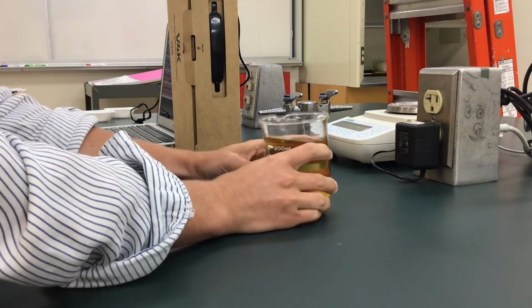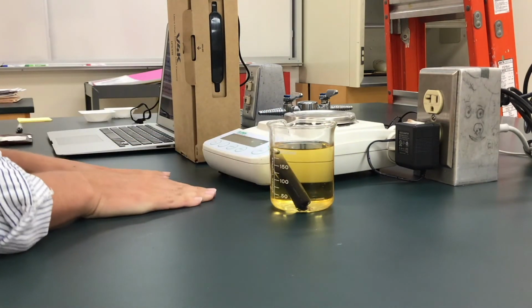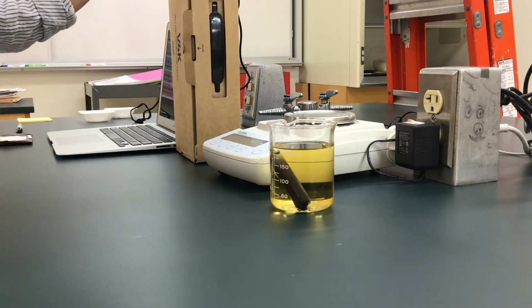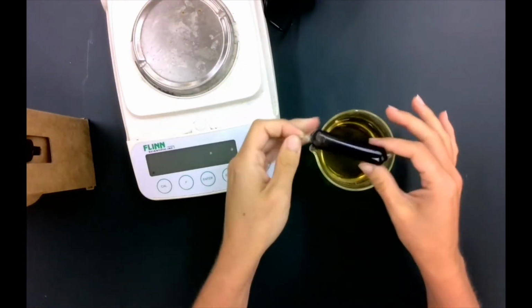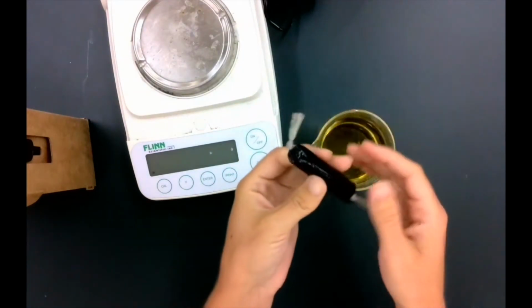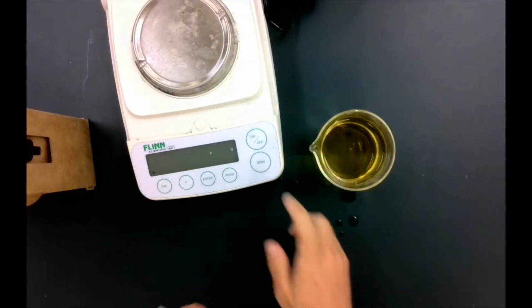Alright, and we are back to get the measurement on our dialysis tubing. So we are going to need our scale right here. And we're going to take it out of the solution and see if we've had any net movement of any of our materials. So first of all, I'm going to take it out and examine it. I want you to know that it feels very full compared to when we started, when it was quite loose and baggy. Now it feels very full, and looks much more like candy.